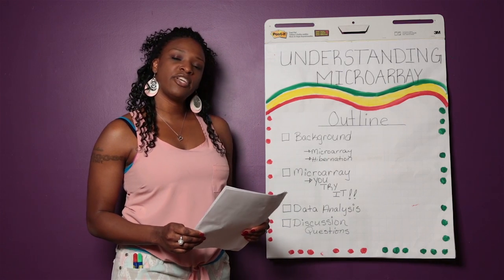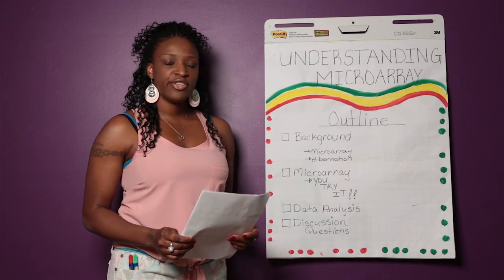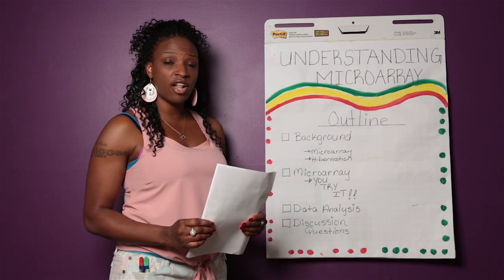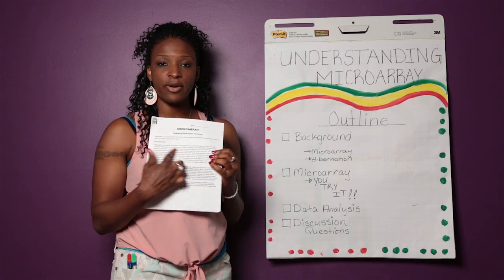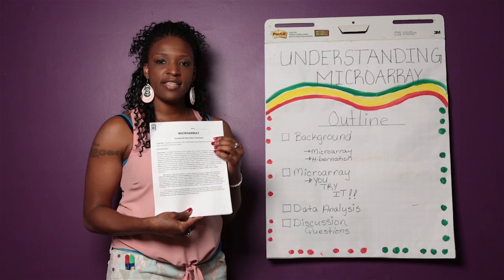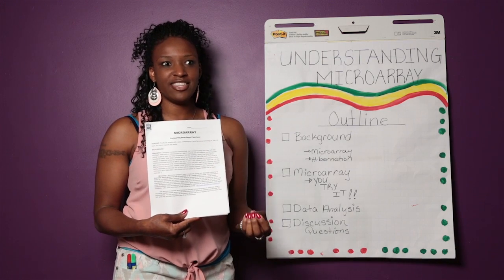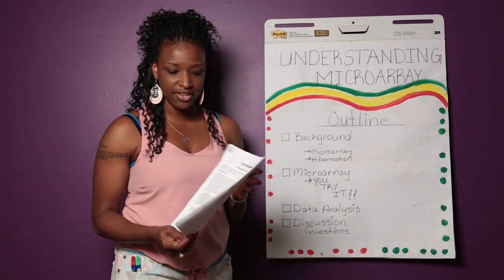Today I would like to share with you a little bit about microarray technology. So what you're going to need in order to follow along is this packet here. This printout here is entitled Microarray. And this is something that I made to help students and to help teachers teach their students about microarray technology.